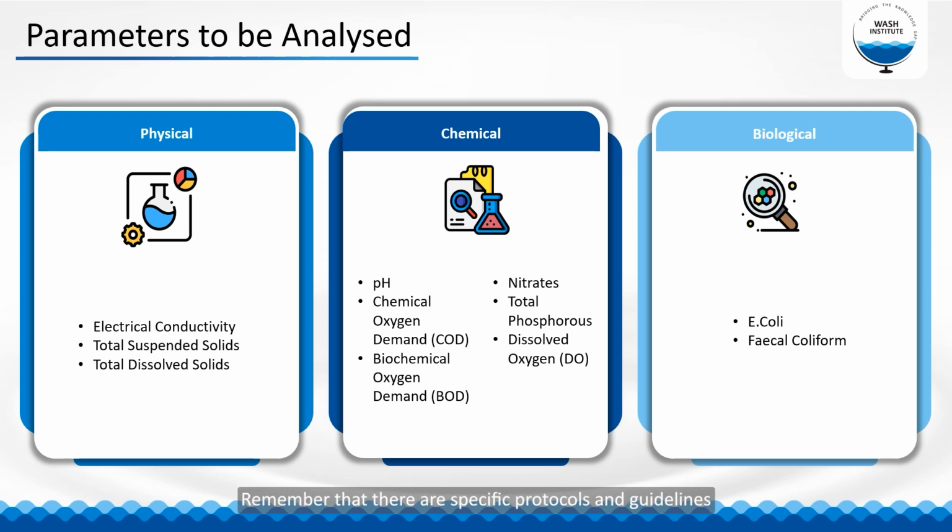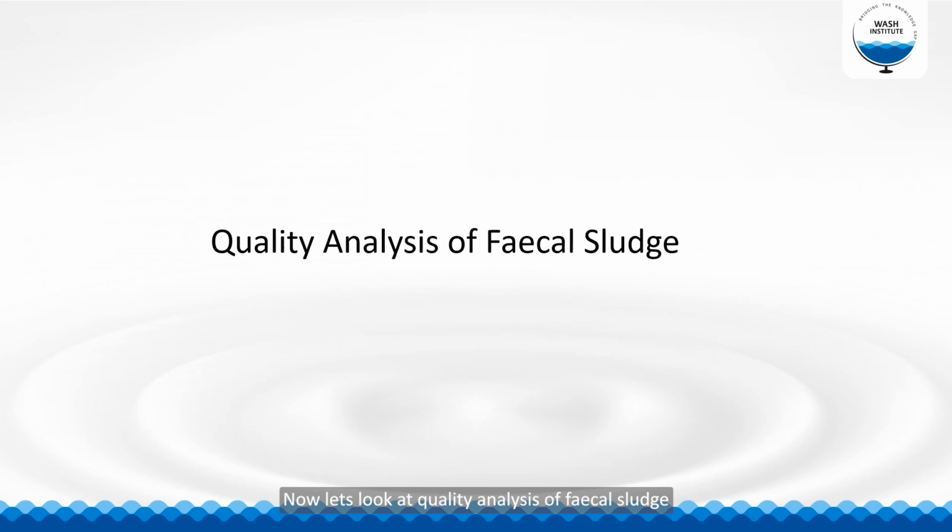Remember that there are specific protocols and guidelines available on how to analyze each of these parameters. Make sure the laboratory strictly follows these guidelines. Now, let's look at the quality analysis of fecal sludge.